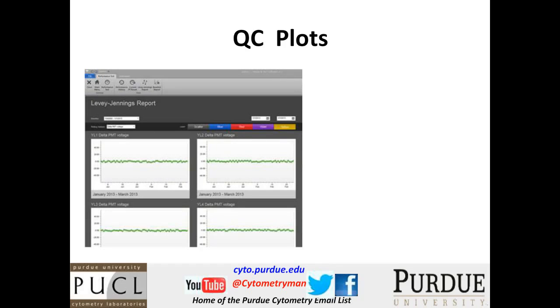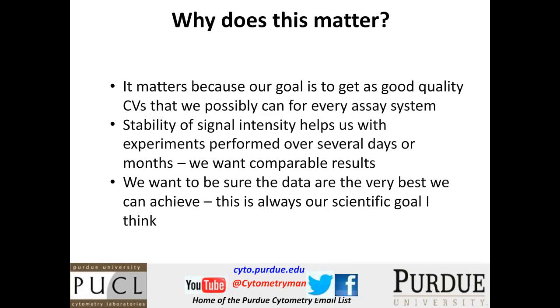It has that feature, which is very, very important quality control. If you want to review whether or not your instrument has been performing, this is the way to do it. And I strongly recommend that you take note of those plots if you have not been doing so. Something that's very easy to see on the Attune, and I strongly recommend it.